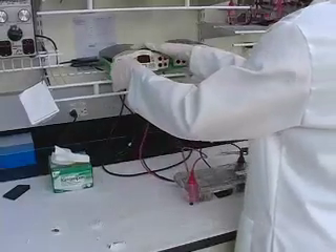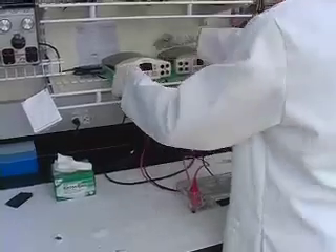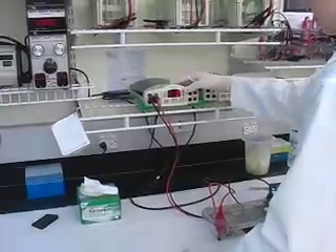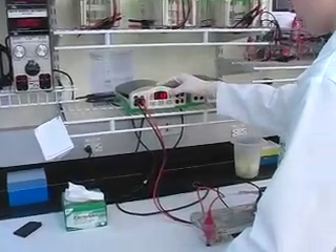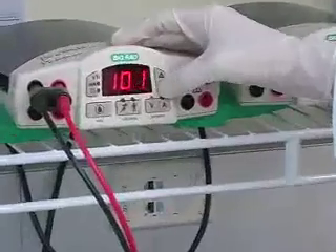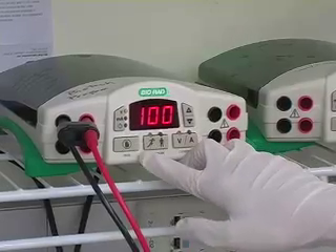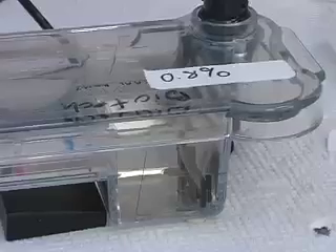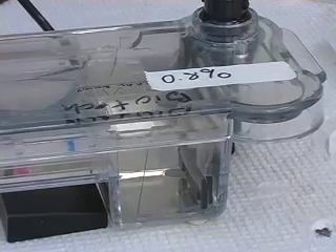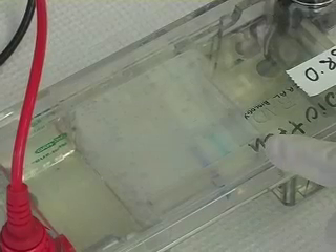Plug the leads into the power source — red to red, black to black. Turn the power source on, set the constant current or voltage, and press run. Watch the gel to make sure it is running properly. You will be able to see the gel front move towards the red lead. The blue line is the gel front formed by the loading dye.